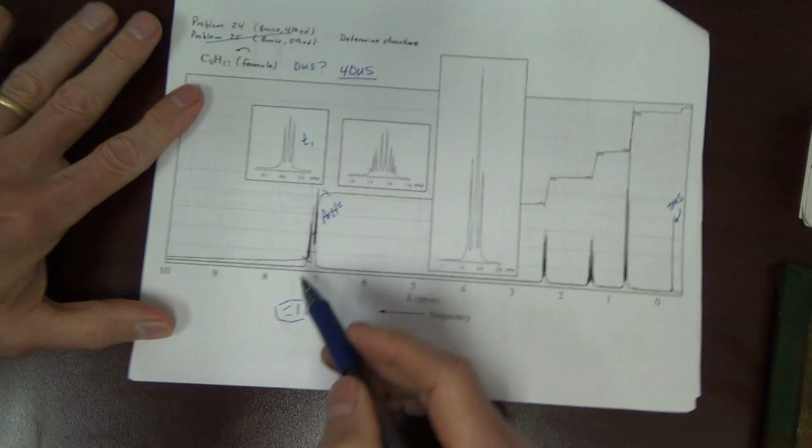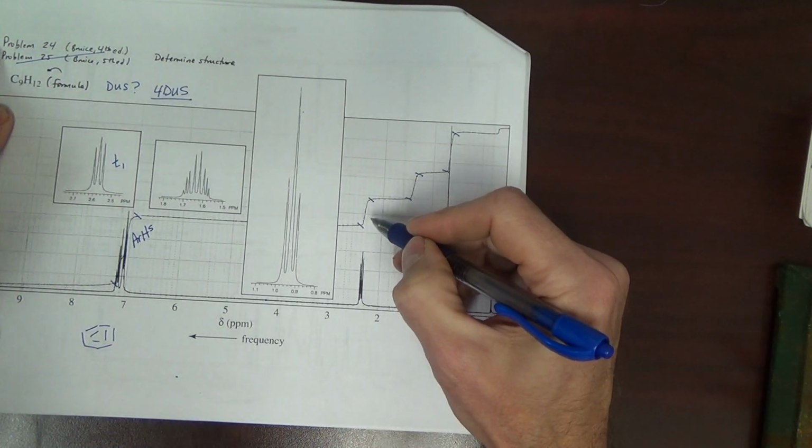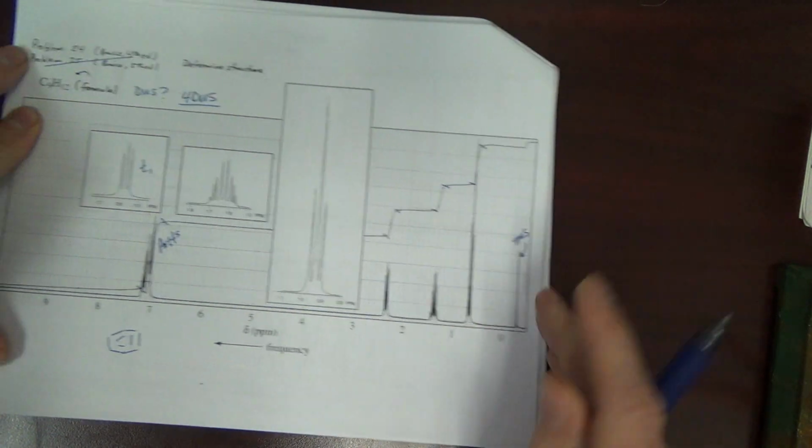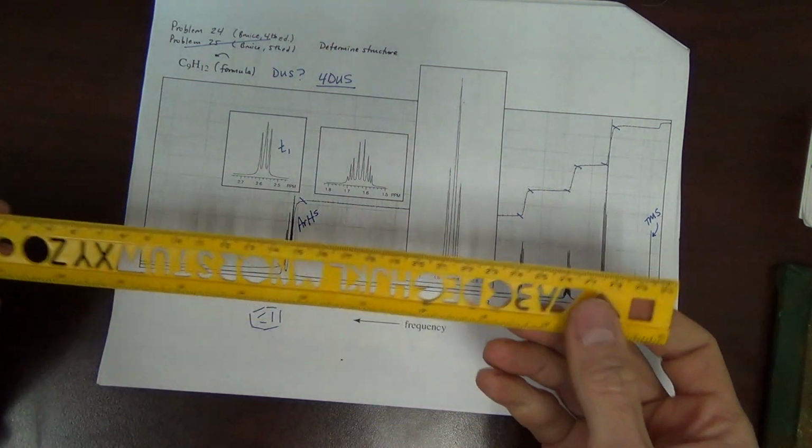And let's look at integration. We have integrals here, here, and I marked them at the end of the previous video. Okay? Now let's look at these. I'm going to get my ruler. Alright, I only have a large ruler.